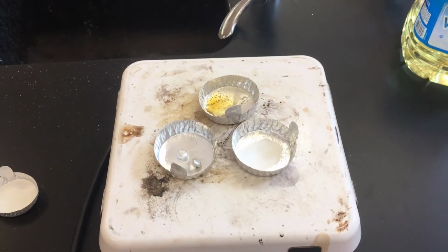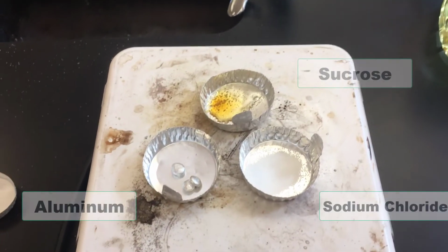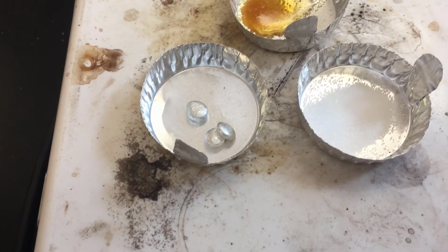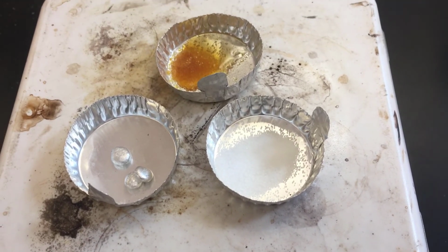Okay, so this has been a couple of minutes here. So we took the paraffin off because it was starting to get very, very stinky. You can see our sucrose has undergone some changes, and our aluminum and our table salt, our sodium chloride, have really not. So just a little add-on to that melting point. We didn't really see a visible change to the aluminum pieces, but when we went to throw it away, these two did sort of fuse together, so they were at least melting a little bit. The sodium chloride, nothing.